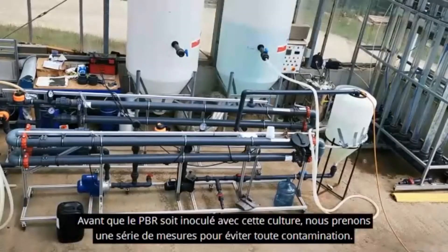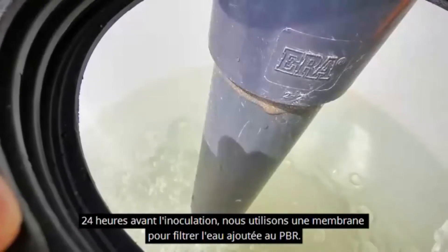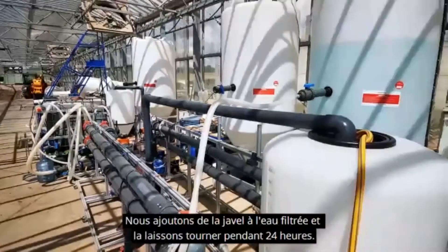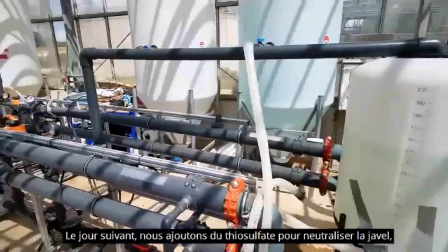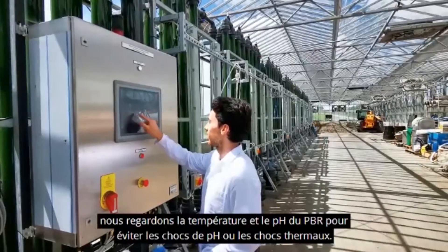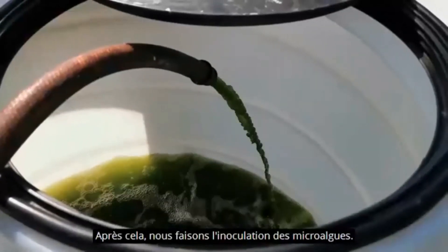But before the PBR inoculation with the culture, we must first take a series of steps to avoid any kind of contamination. 24 hours before the inoculation, we use the membrane to filter the water that is added to the PBR. We add bleach to the water filtered in the PBR and we leave it running for 24 hours. The next day, we add thiosulfate to neutralize the bleach. We check the temperature and pH of the PBR to avoid thermal or pH shocks, and after that, we perform the inoculation of the microalgae.